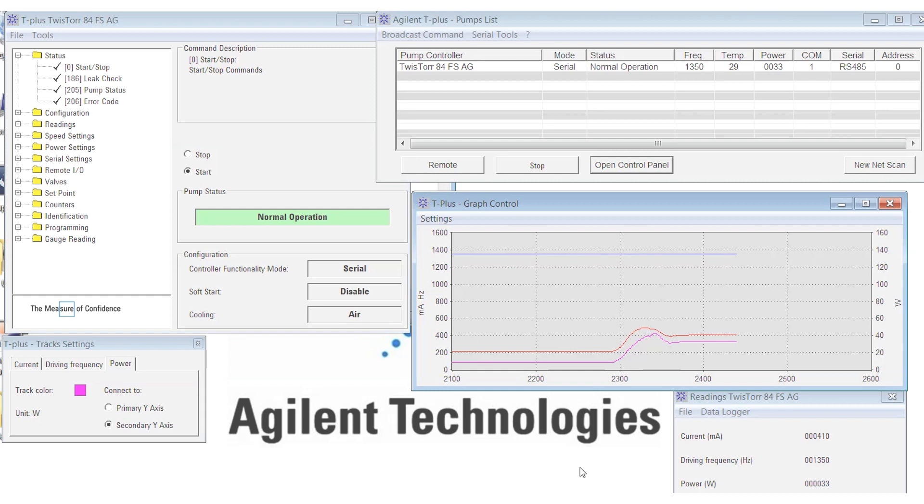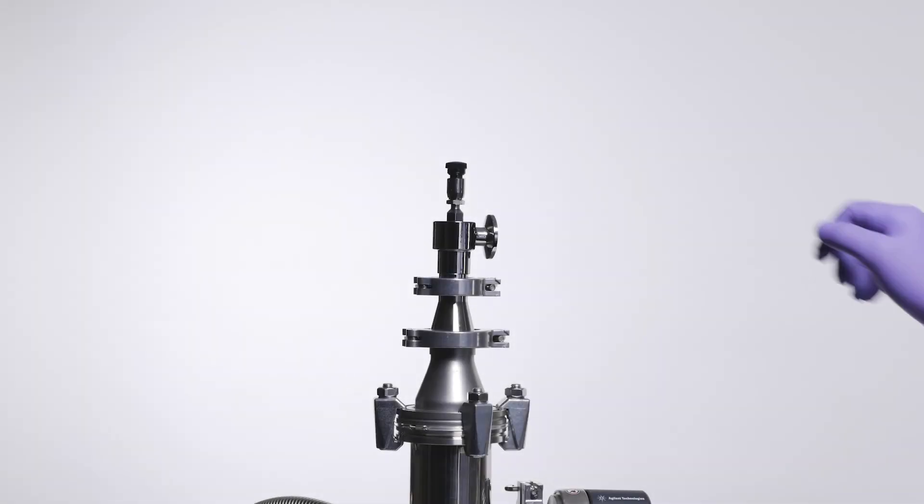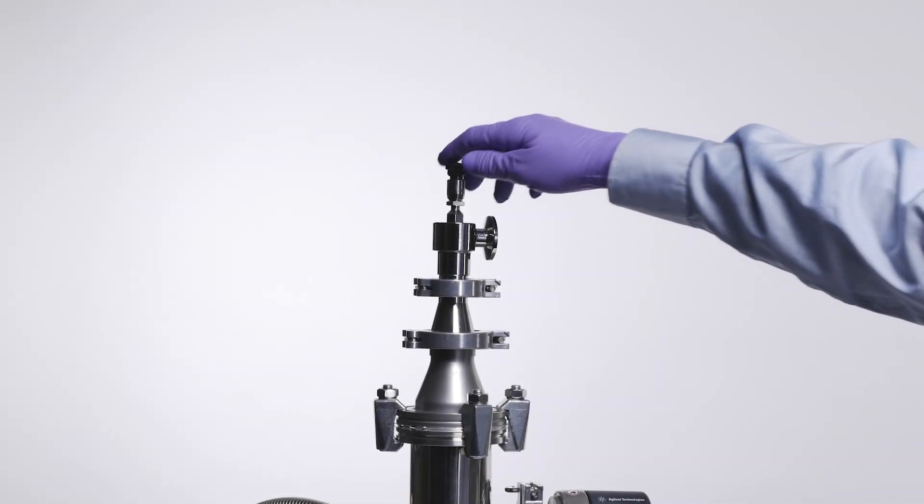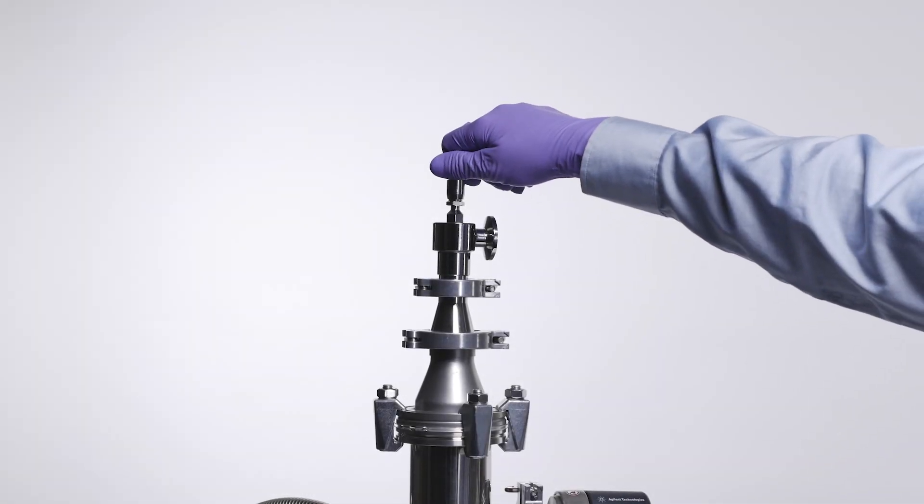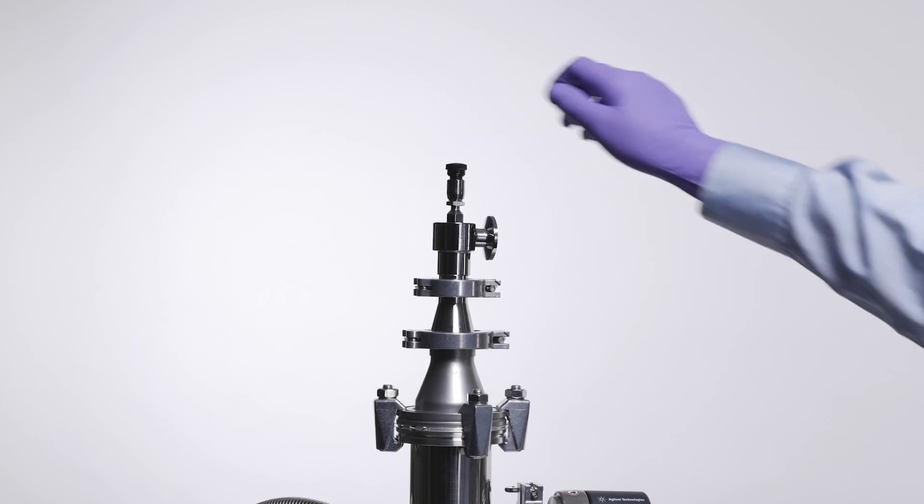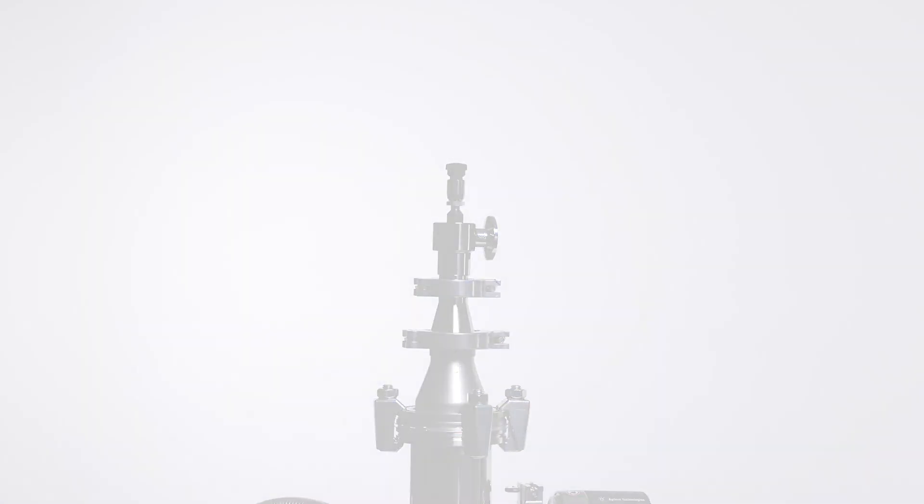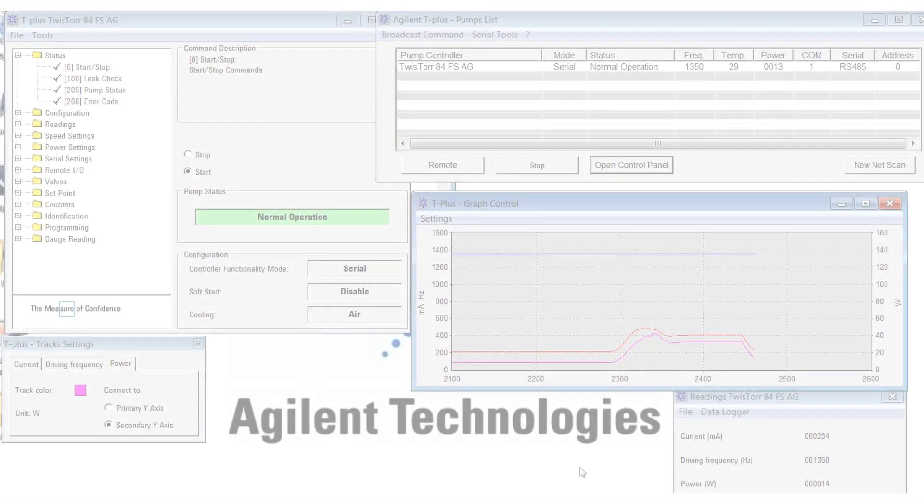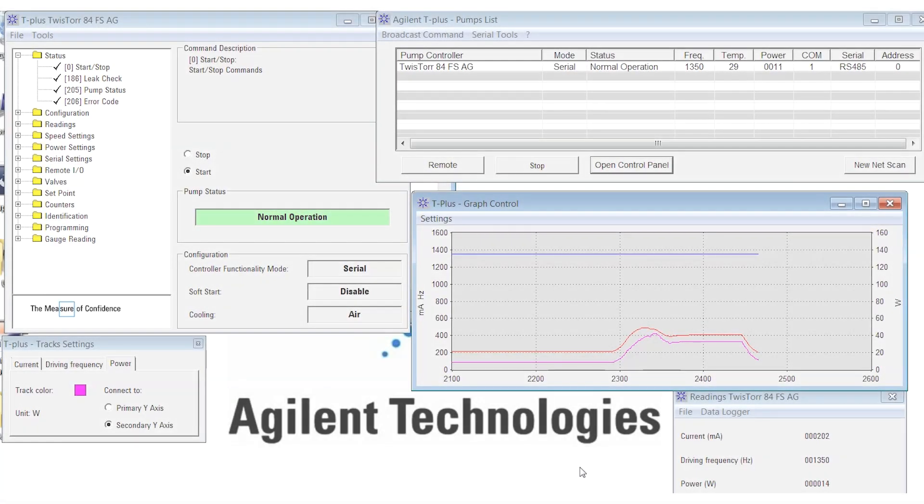At even higher gas loads, water cooling may be necessary. For now, I'm just going to close off my gas inlet valve. You'll see the power and current drop fairly quickly back to their original values.